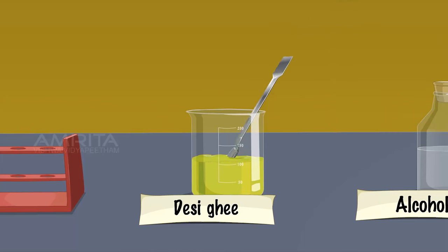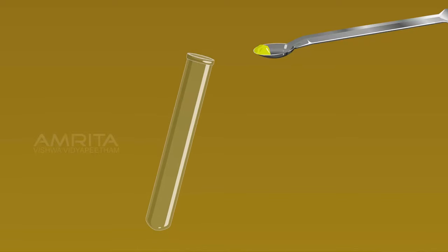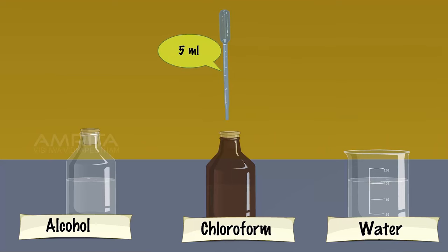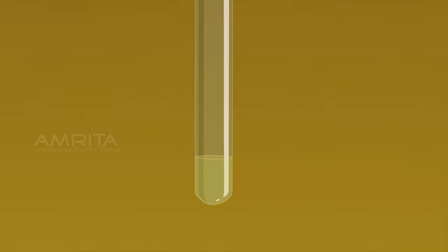Again, take a small amount of desi ghee in another test tube. Using another dropper, take about 5 ml of chloroform and add it into the test tube containing desi ghee. Desi ghee is miscible, i.e., mixable in chloroform.